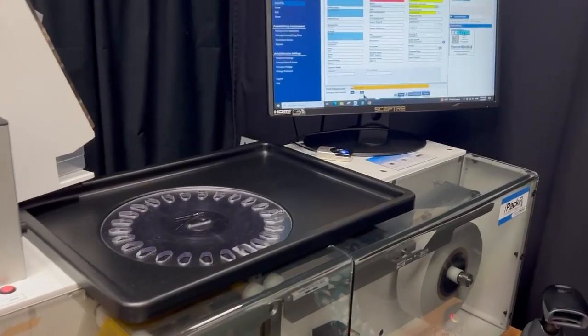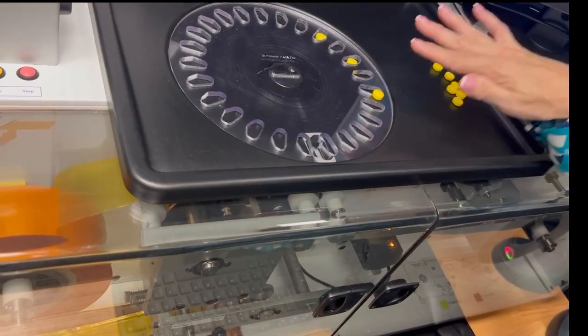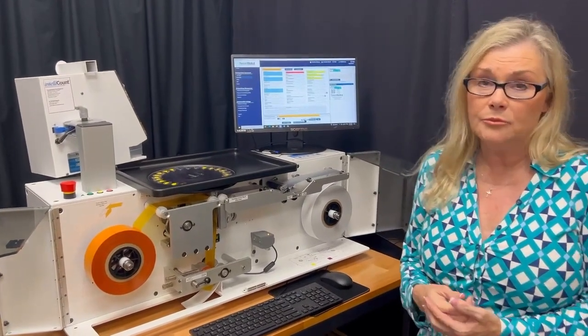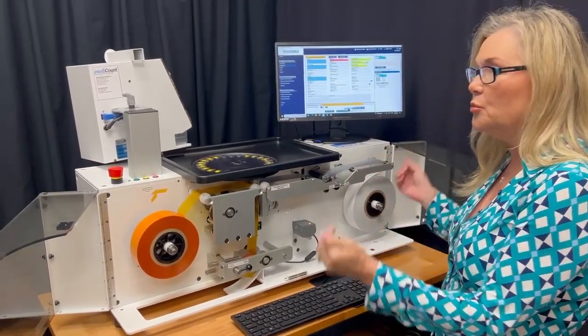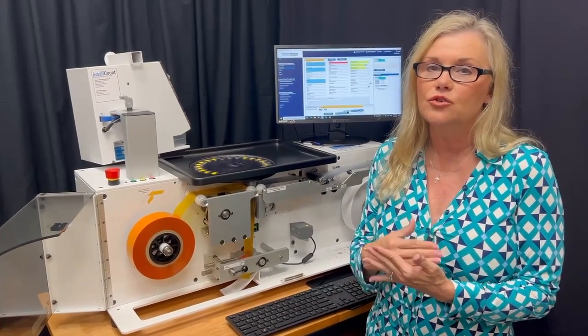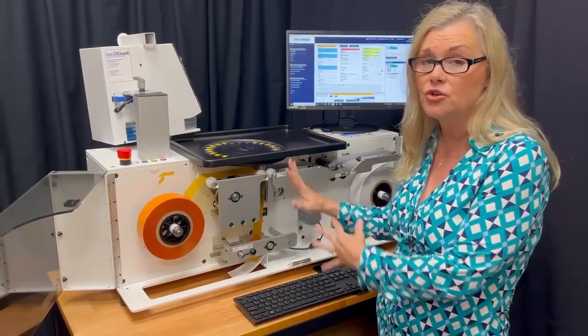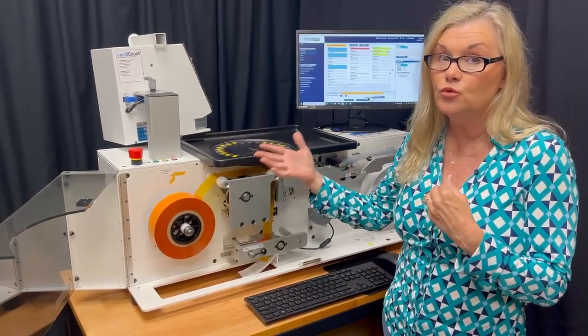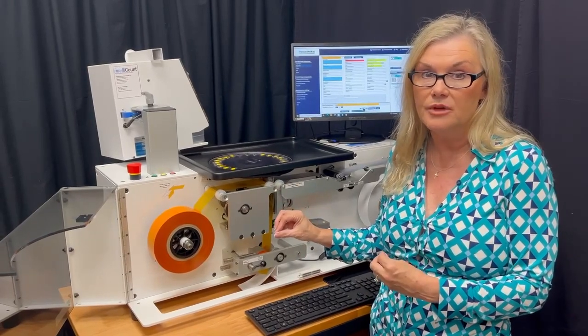I'm going to pour these pills out — it's set for 10, so all I have to do is press print. Now I'm going to show you the pill pathway within the machine. We've asked one of our super technicians to open the doors and pull the safety sensors so I can show you the packaging operations inside the machine. Note: this is not something you are authorized to do in your pharmacy — this is only for our technicians. In fact, if you open the doors while the machine is in operation, the packaging operations will stop because of the sensors built in. That is designed for your safety.